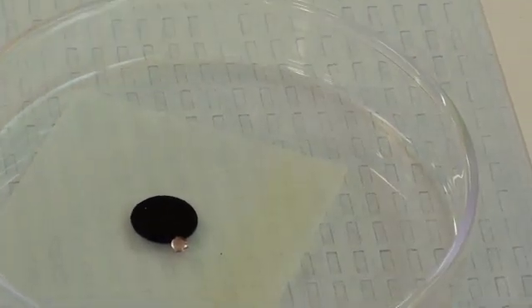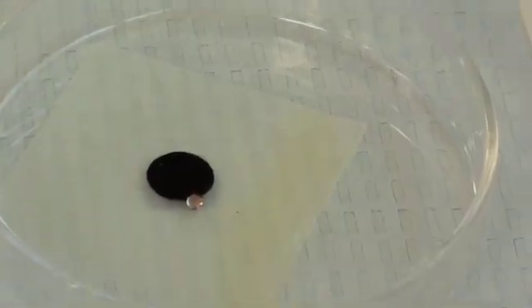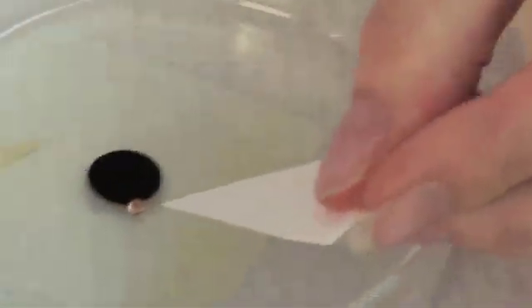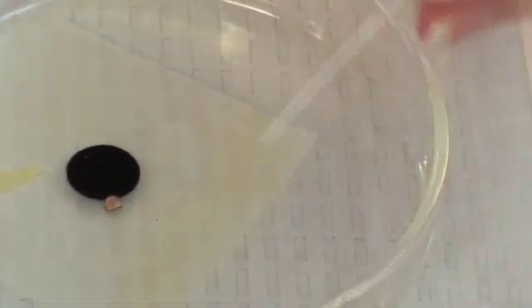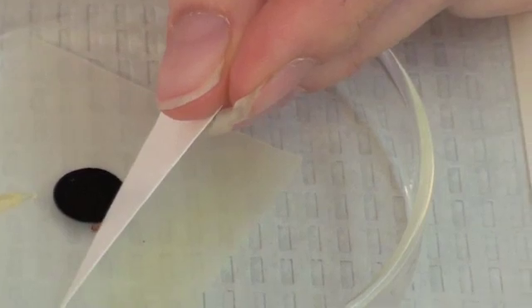When the sample, or the water in this case, has been on the grid for the specified amount of time, it is then wicked off the grid. Here you'll see the instructor using a piece of filter paper to wick the water off the grid. The water is sucked onto the filter paper. Here you can watch it being sucked on.